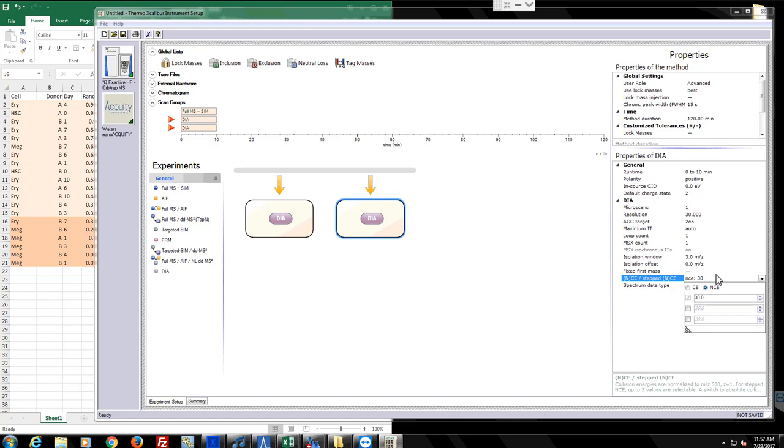If it's a higher window, it will do a higher collision energy. But of course, it can't simultaneously optimize for multiple charge states. So the best we can do is to say, most of the things I care about are going to be doubly or maybe triply charged, and it'll optimize assuming that, and then also do a slight optimization based on where the window is located.